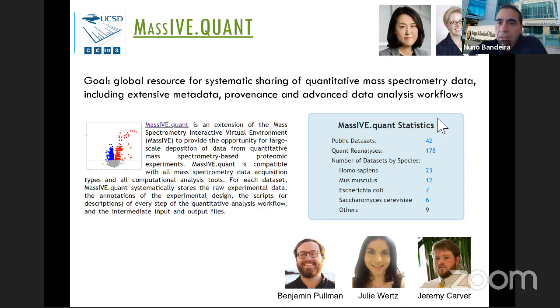So great to share proteomics data. However, for quantitative analysis, what are the strategies for QCing the uploaded data, not knowing the experimental designs? This is a great question. There are tools that can be used to do this analysis. We are starting to develop reports to generate QCML files as a result of the data that's uploaded. That's still work in progress at this stage.